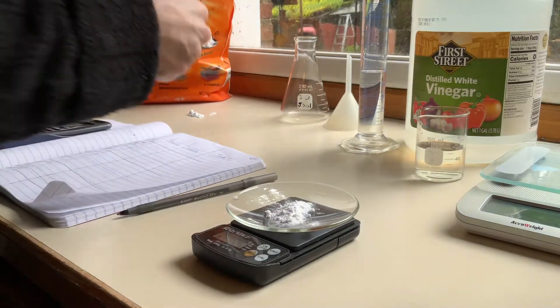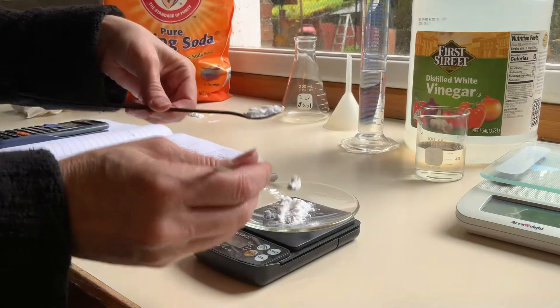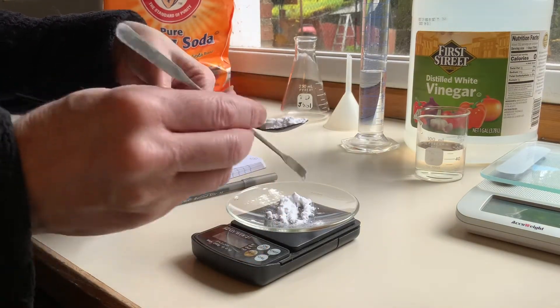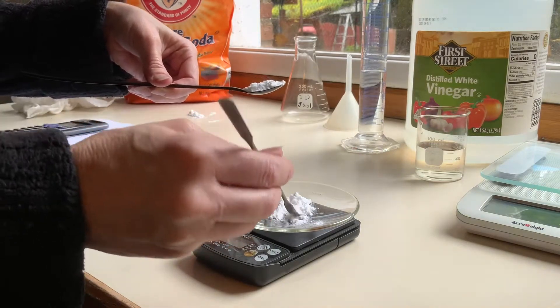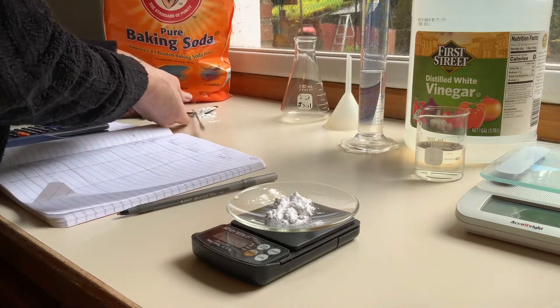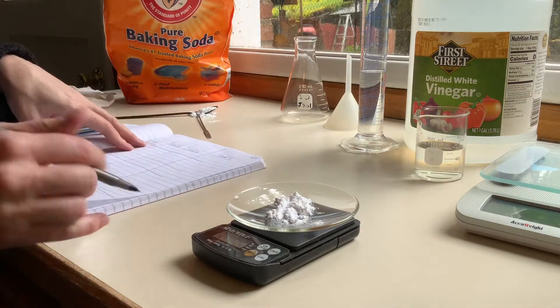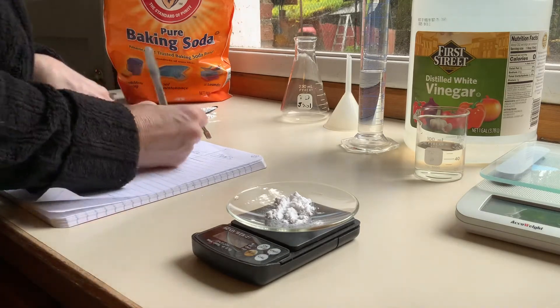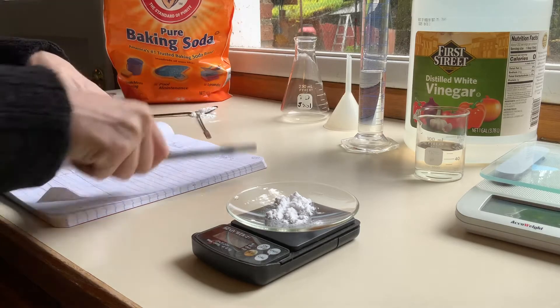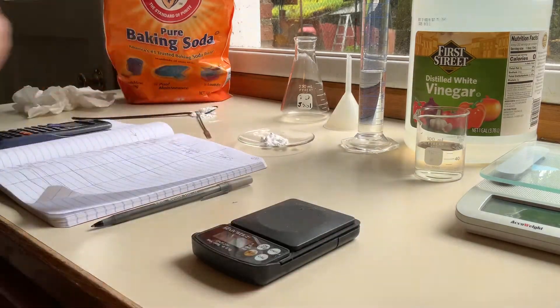Oh, that's too much. Let me take away a little more — 2.4. Now it's 2.3. In the lab we'd love to have another decimal place, but we don't have that. So the mass of baking soda is 2.3 grams for trial two.